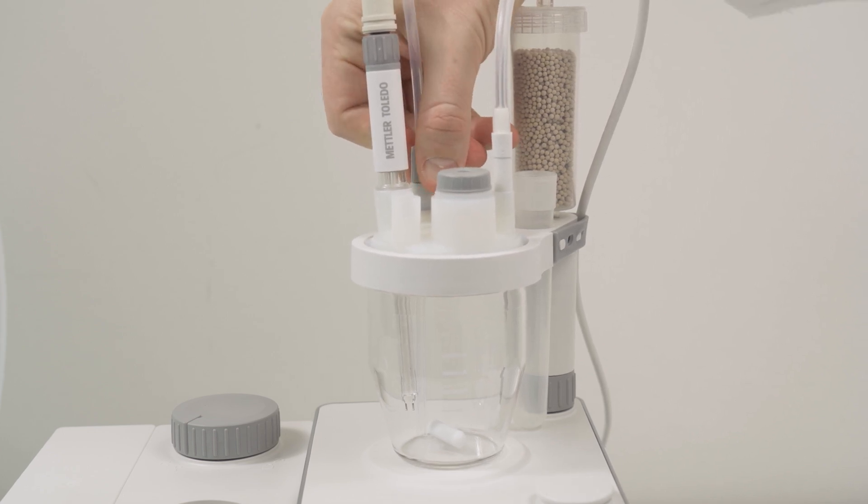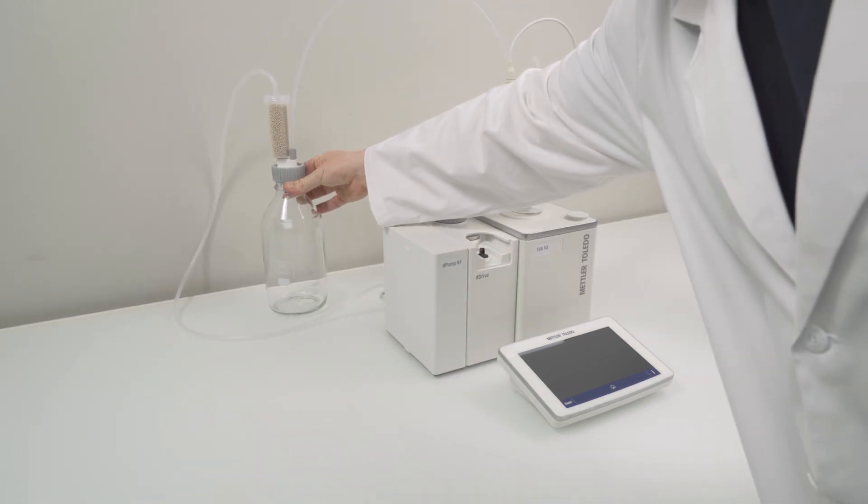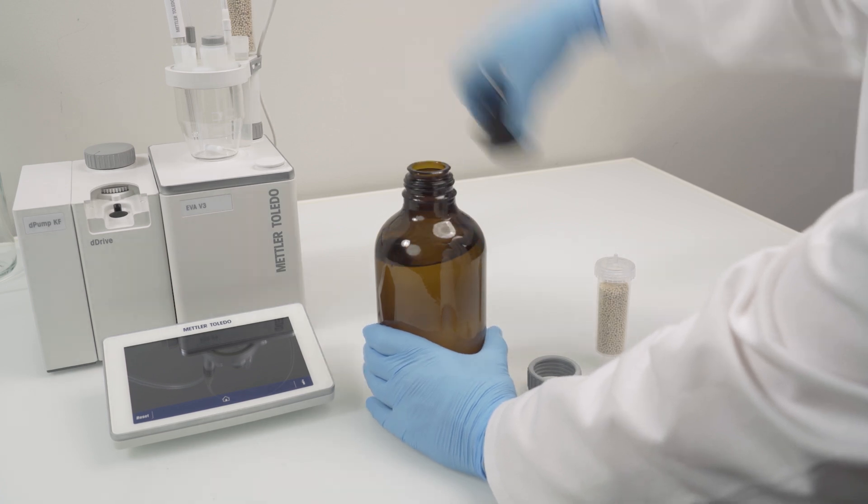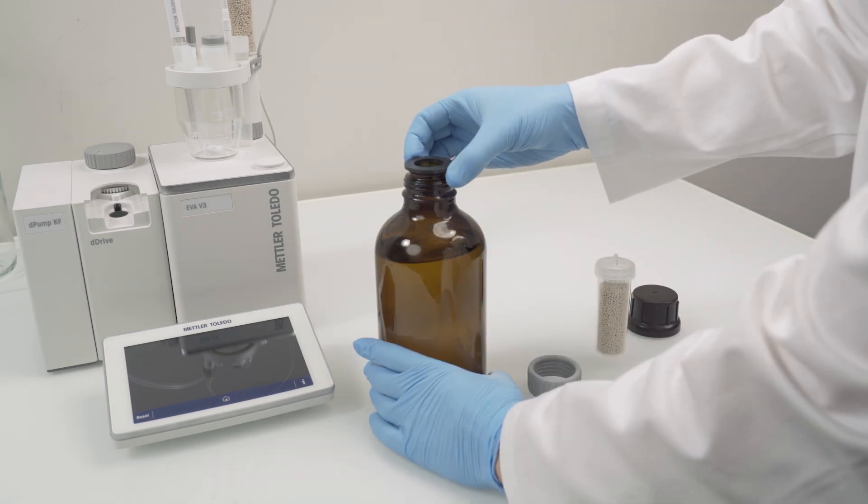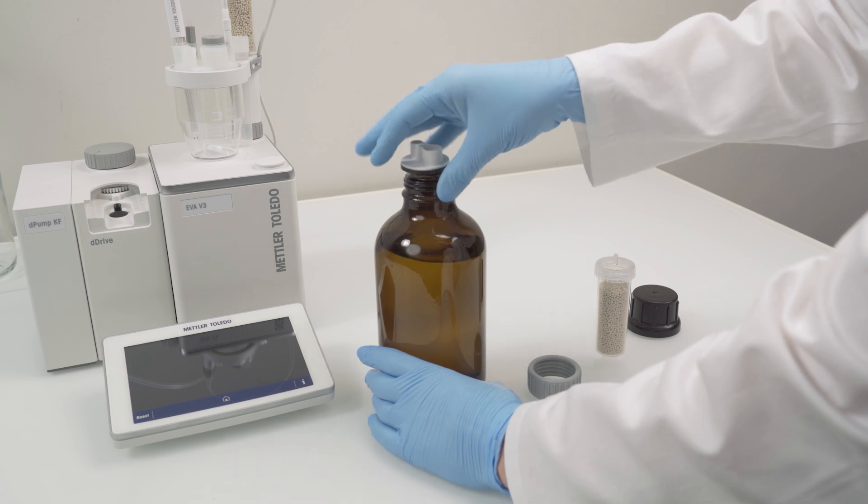Before we continue with the assembly of the solvent bottle, we need to make some space. Move the waste bottle to the back side of the instrument. The solvent bottle is assembled similarly to the waste bottle. However, from now on we are working with chemicals, so make sure that you additionally wear safety goggles and gloves.